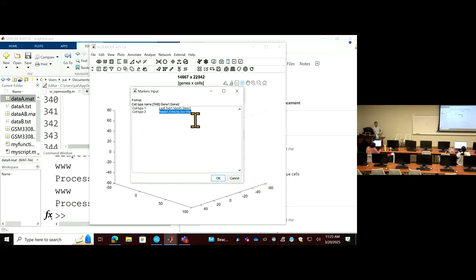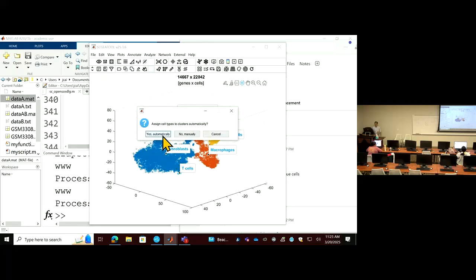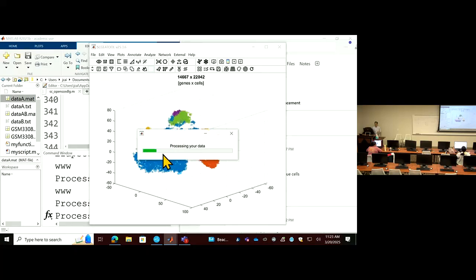It just gives you some idea what you should put in there. You need to have a cell type name, then marker genes based on your own study. So once you have this database in, you can click, then allow the program to process.